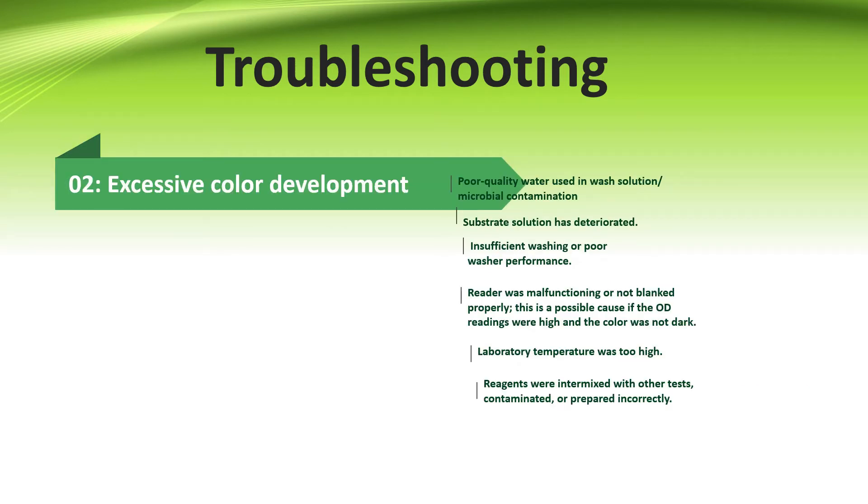If there is excessive color development, the reason could be poor quality of water in the wash solution, or it can be microbial contamination. Second, if the substrate solution is deteriorated. Third, if the ELISA washer is showing poor or insufficient performance. Fourth, when the reader was malfunctioning or not blanked properly. Next, lab temperature was too high. And at last, reagents were intermixed with other tests or prepared incorrectly.